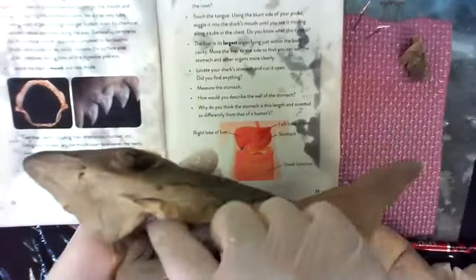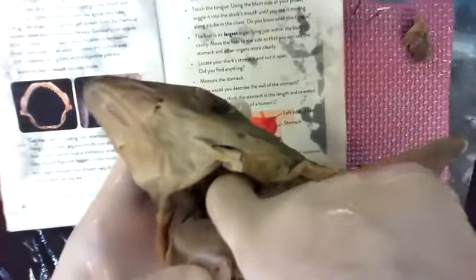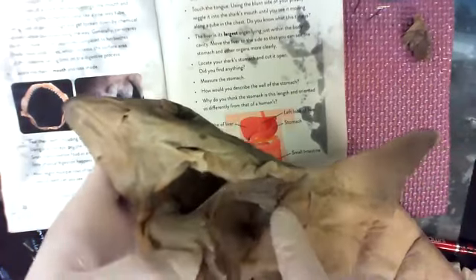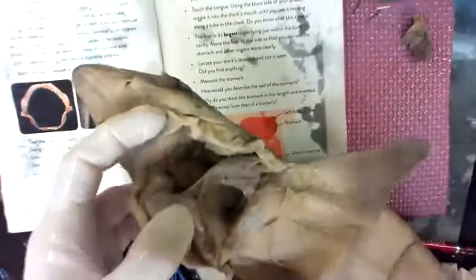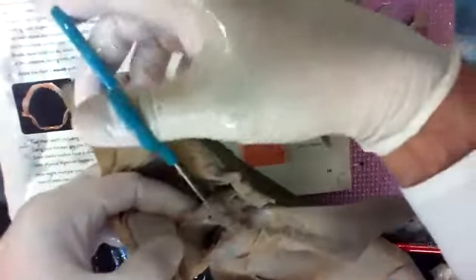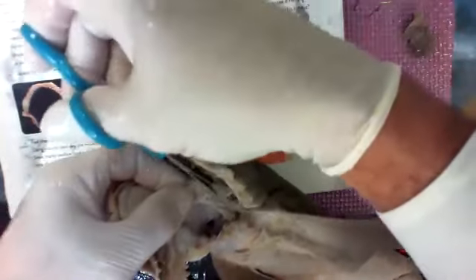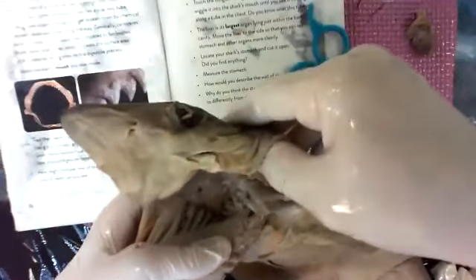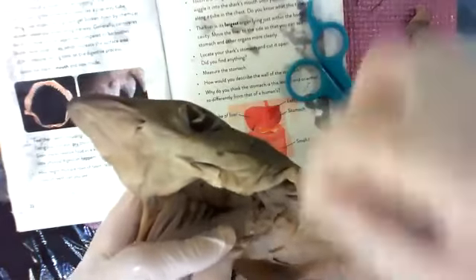We're going to follow this down. So there's the tongue. There's the food passageway. Oh, there's something in there. Here was the chest. So we're going to actually cut over here again. I'm going to make a little snippety snip. Scissors are where I left them. So I want to follow. It's rough. If I bring my finger up here, somebody already said it, but it's kind of like a cat tongue, so that things that go in don't want to easily come back out. So I'm just going to cut across the gills. I'll look down in there. Look at that. There's the esophagus.